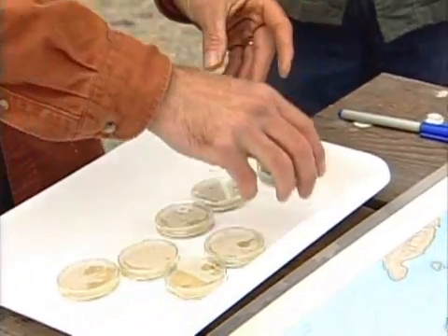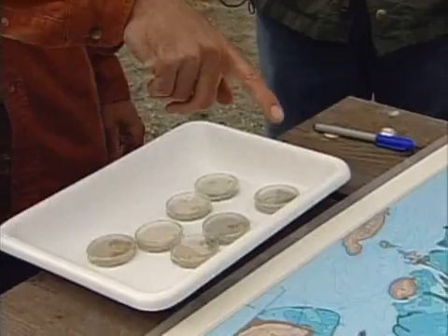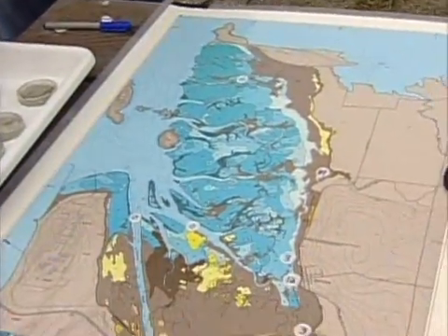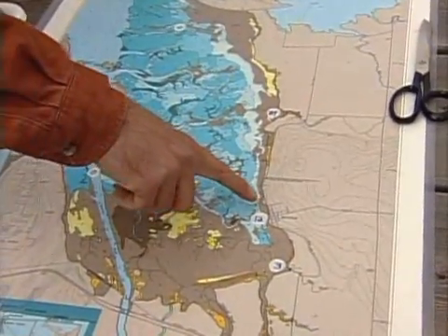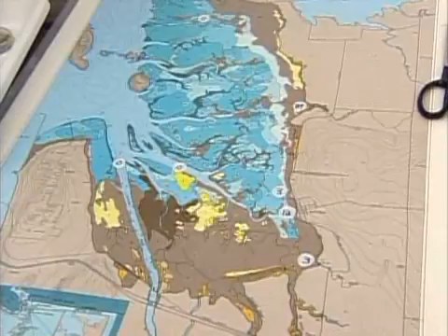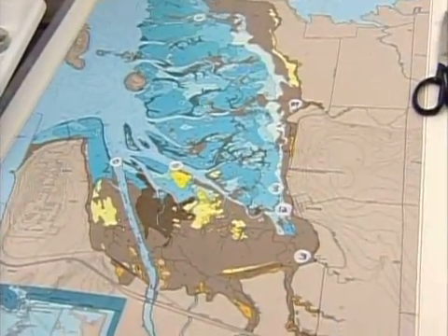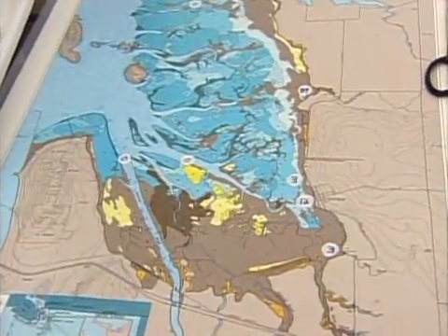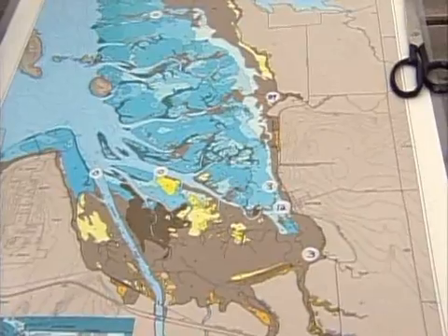Okay, that's the little dish there. What else are you going to show us, David? Well, I'd like to show the map here just to give an idea, because I know people are from around the country, they don't know this area. We are situated right here. There's a little town on that map called Bayview, and we're right by the number 3, and that's Bayview State Park. And the 3 is the result when we went back and counted the colonies or number of bacteria that grew in 100 milliliters of water. It was 3.